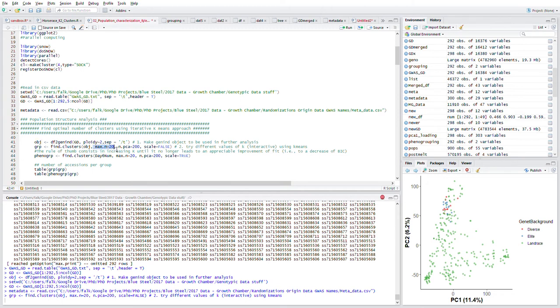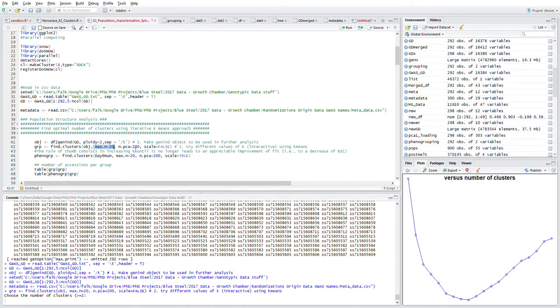The number of PCA plots it uses is up to 200, and the scale is set to false because this is SNP-by-SNP data. We don't need to scale it. If it was some other type of data like phenotypic data, then yes we would scale.